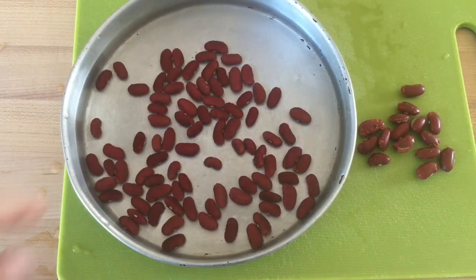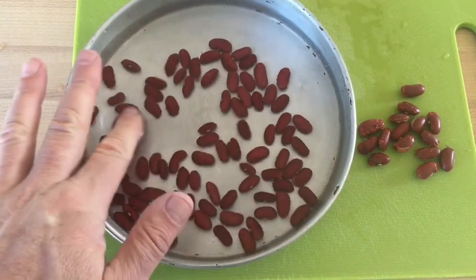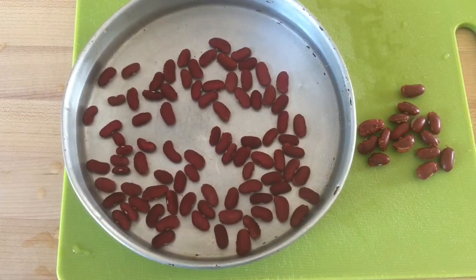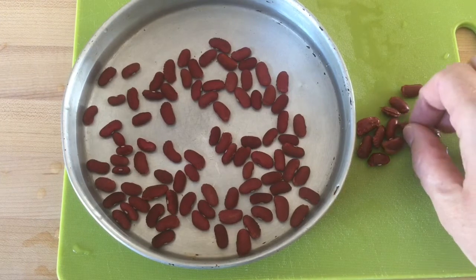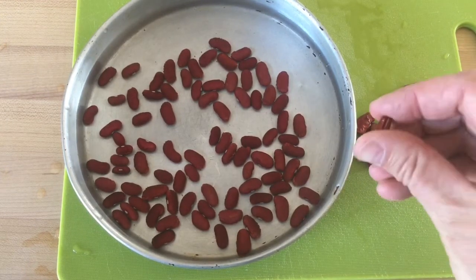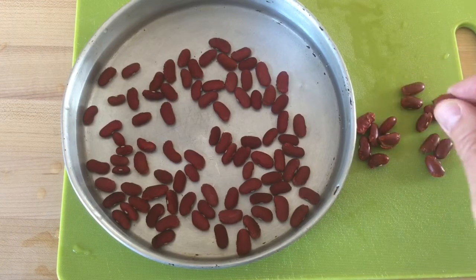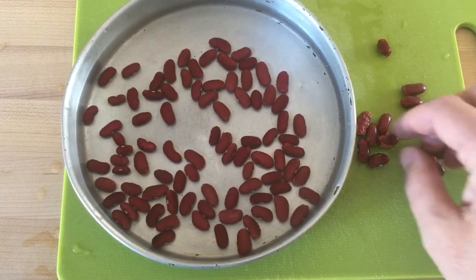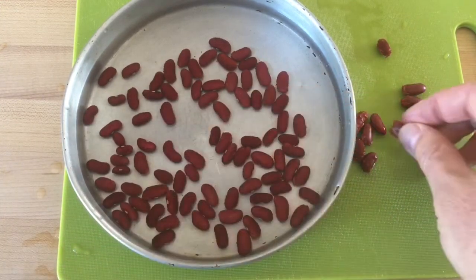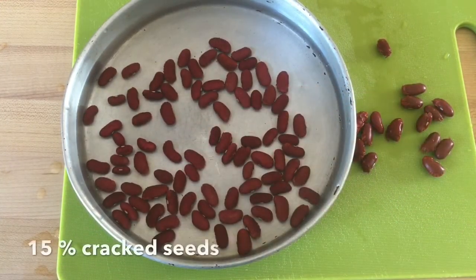With this sample I've been letting it soak for five minutes and gently swirling the seed back and forth. As I've been doing that I've been looking for any seed that is cracked visually — some are more pronounced than others. You can see here some seeds are split right in half, and some are not as pronounced but the seed coat is just starting to come off. I count all those up and I come up with 15 percent.